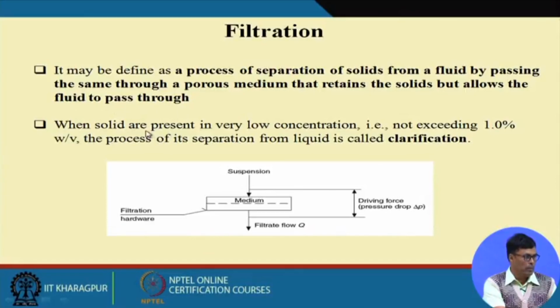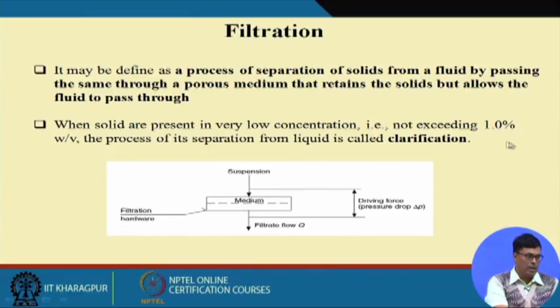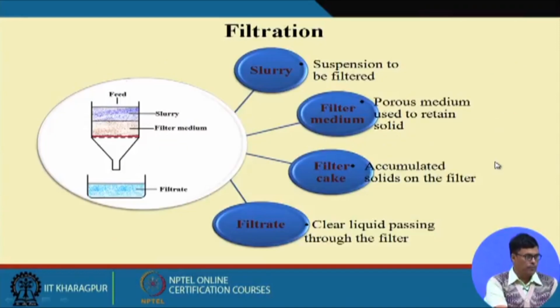When solids are present in very low concentration, not exceeding 1% weight by volume, the process of separation from the liquid is called clarification. So clarification means the separation of solid from the liquid.